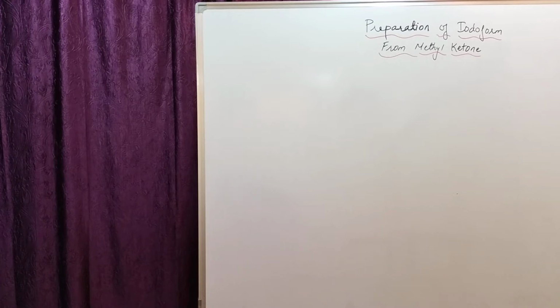I welcome you to another session of practicals of synthesis of organic compounds, the simple methods of synthesis. In the previous video, I had explained the acetylation of aromatic primary amine. In this particular session, I am going to discuss with you all the preparation of iodoform from methyl ketone.